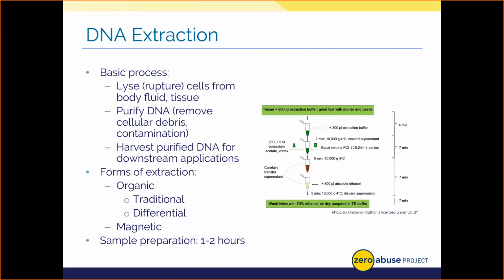Now, there's a few typical methods for extraction. In organic extraction, we use harsh chemicals and rough action, like stirring or shaking, to rupture the cells open. We even use a variant form of organic extraction called differential extraction for cases where we believe sexual assault occurred. Basically, we can separate out the victim's epithelial or skin cells and sperm cells based on their unique structure, and then create the 2 different profiles from there, instead of having to deal with a mixture, which some of you might know are a real pain to deal with. There's also magnetic systems that can be used where DNA is lysed and then attached to magnetic beads that are then washed and the DNA is extracted. All this is done by an automated or robotic machine.